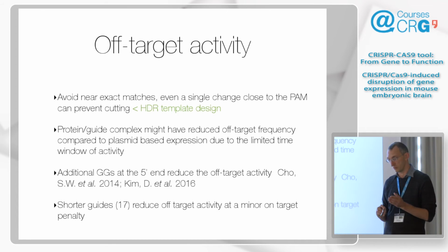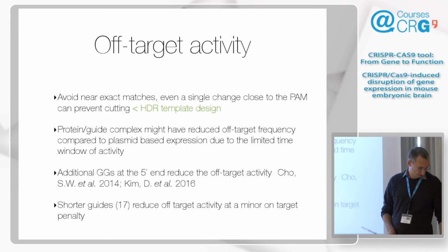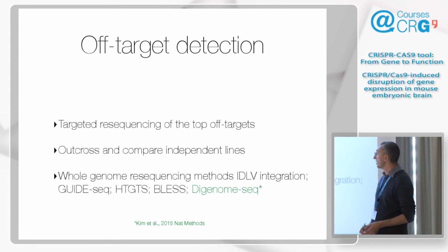There is an intermediate in between, and this transition is affected by this. Of course, it will affect off targets more than on targets, and that's how it helps. I think that's the idea. So adding 2 Gs to the end does not hurt in any way, so I recommend it in general because it shows that it helps. So how do we deal with off targets?